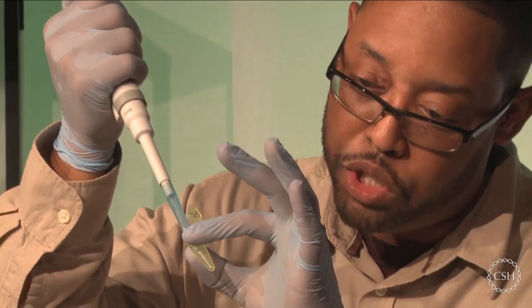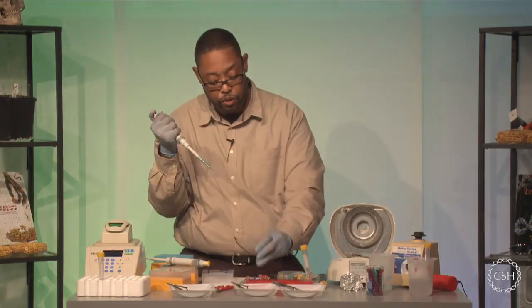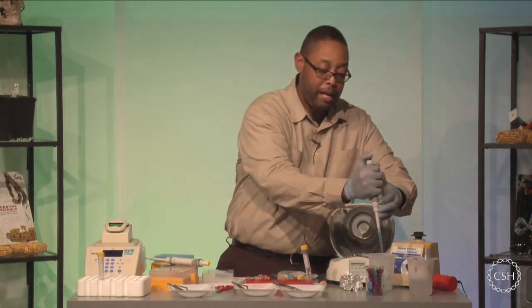Please be sure that you're changing tips each time, because we don't want to introduce any contamination, and this is a crucial step at this point.